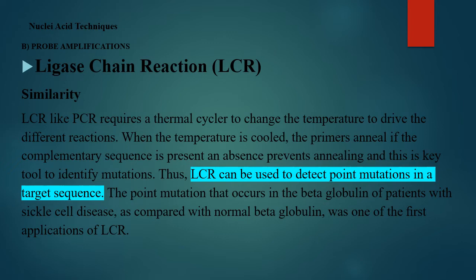So generally, ligase chain reaction (LCR) and polymerase chain reaction are similar in using the thermocycler, which helps raise temperature and then cool it at specified periods for the chain reactions to take place.